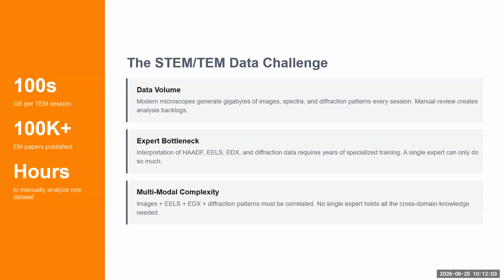There's a lot of data volume, right? When a user uses a microscope, it makes a lot of data. We can get a lot of images, spectra, and diffraction patterns in every session. And then we have to have an expert that actually understands and interprets the HAADF, EELS, EDX, and diffraction data, and this can take a lot of time, and it also requires a lot of specialized training to actually understand that.